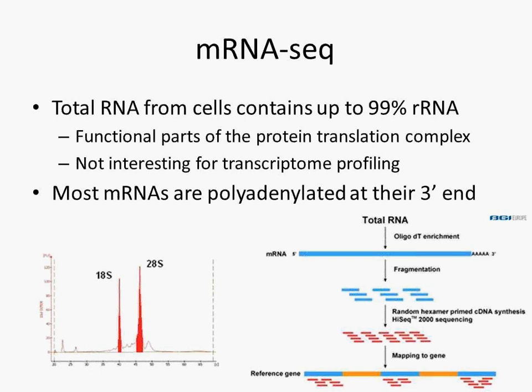And then in those samples where we have all that RNA left, and then Mehdi described a very deep poly-A selection approach. Maybe even get strand-specific. I mean, absolutely get strand-specific sequence on it. And so we're not doing that for every single sample in the database, but we're doing it to really get this other dimension of information from samples that we have vetted based on the conventional mRNA profiling as being really good.